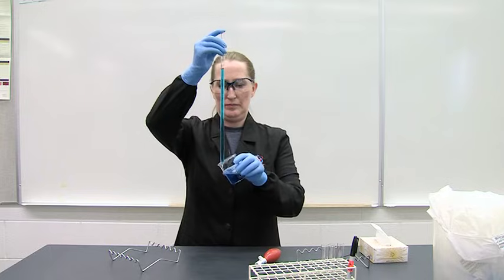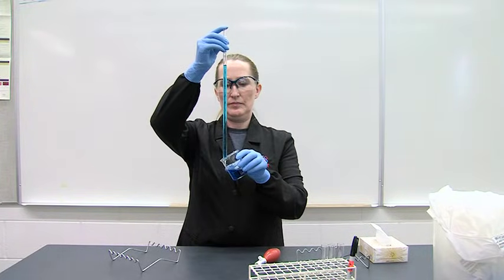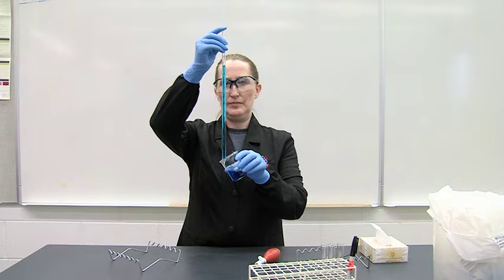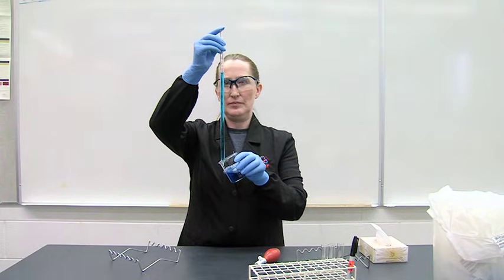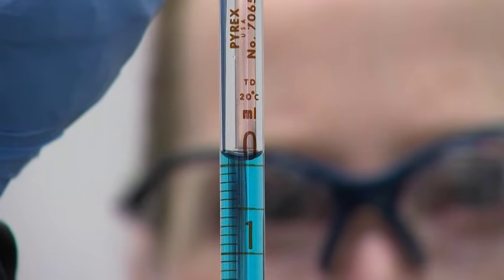Raise the calibration line to eye level. Slightly release pressure from the index finger, allowing the liquid to flow at a slow and steady rate. Press down firmly with the index finger when the bottom of the meniscus is sitting on the calibration line.